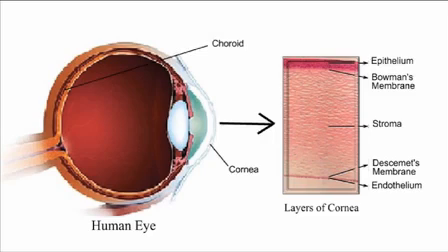The choroid is the intermediate tunic between the sclera and retina, bounded on the interior by the Bruch's membrane, and is responsible for blood flow in the eye. Appropriate evisceration of the choroid is as important as removal of retina.